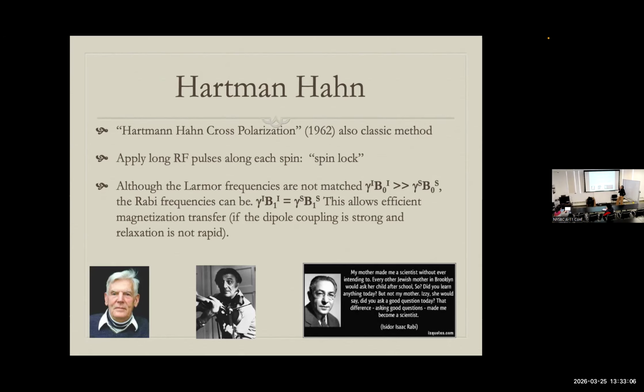And so he became interested in the question, what would happen if, for a directly bonded pair, a hydrogen and a carbon, for example, I matched their Rabi, not their Larmor? Wouldn't that also connect the two dipoles together and therefore create an opportunity for transfer of information or polarization or magnetization?